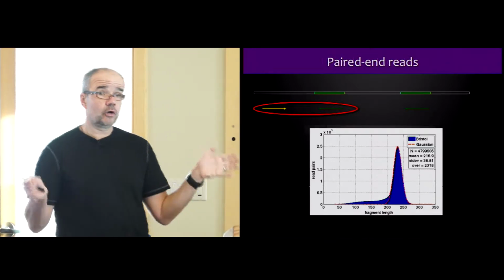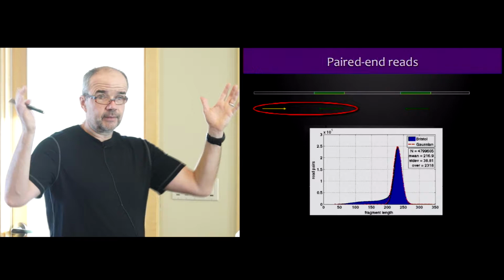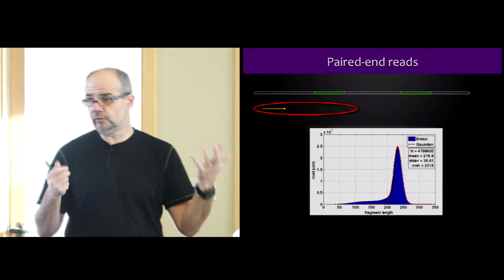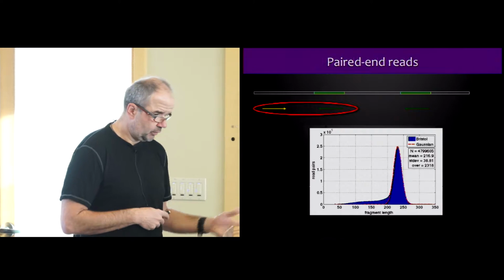Okay? Longer technologies such as PacBio are different because the reads are already longer than what two Illumina reads would span, so the problem is much less acute. Okay? So you can place longer, say, PacBio reads much more accurately to the human genome.